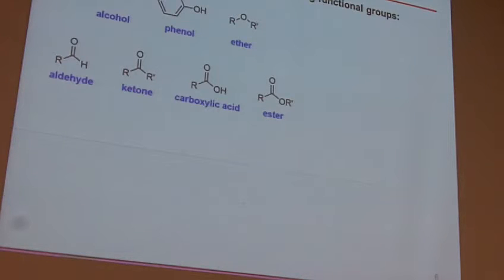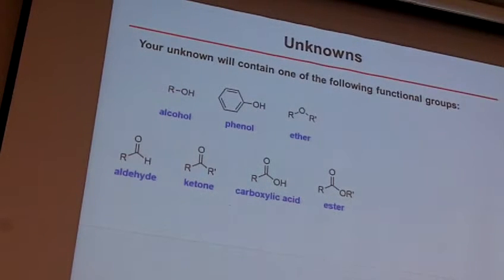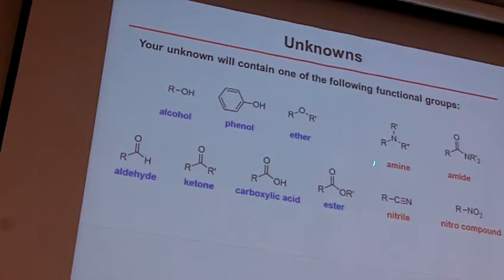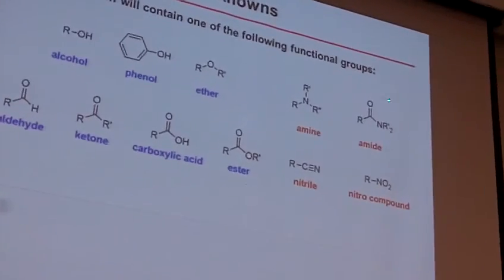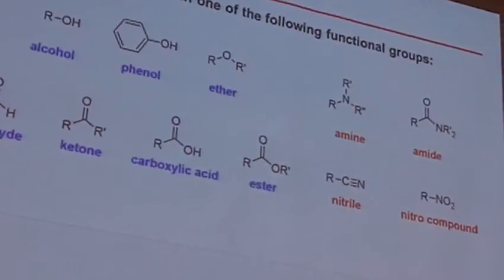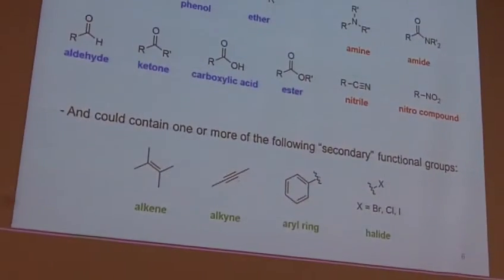All right. Here are the possibilities, and again, definitely don't write all these down. These are all in your lab manual. Your unknown will contain one of the following functional groups. We have this whole series of functional groups that are possible. All of these simply contain an oxygen or one or more oxygens. Or it can be something that contains one of these nitrogen-containing functional groups. So you're going to have one of these or one of these. Plus, you can have any of these functional groups as well.